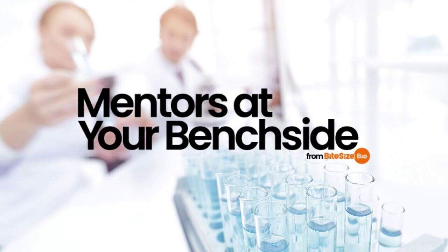Tip 1. Monitor and adjust humidity. To keep static electricity from building up and causing the measurement drift effect, it is essential to ensure that humidity levels for weighing equipment are raised to 40% at installation time. If the static energy keeps accumulating and the rate of electrical discharge is slow, weighing operations should not be made until the electrical charges are eliminated from the weighing sample.